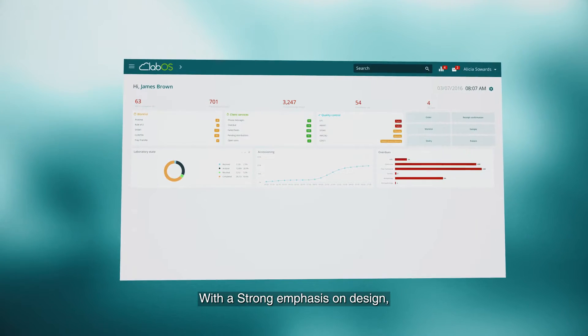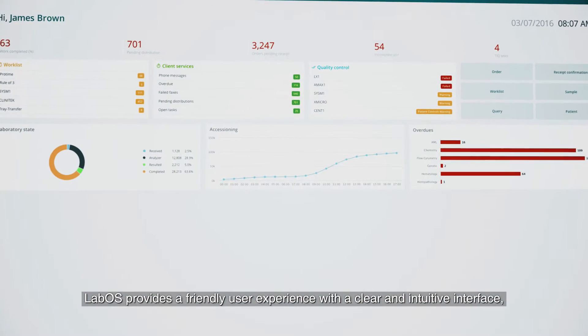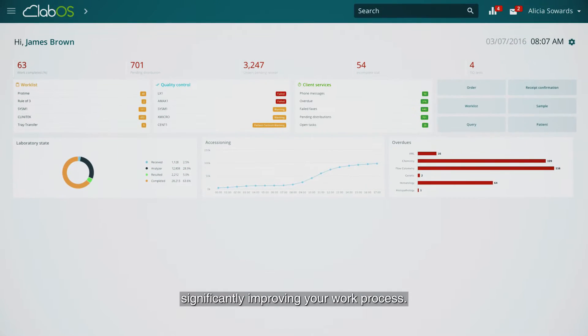With a strong emphasis on design, LabOS provides a friendly user experience with a clear and intuitive interface, significantly improving your work process.